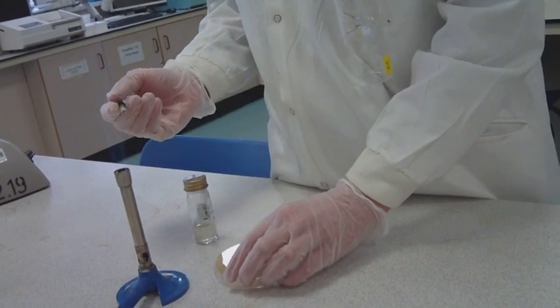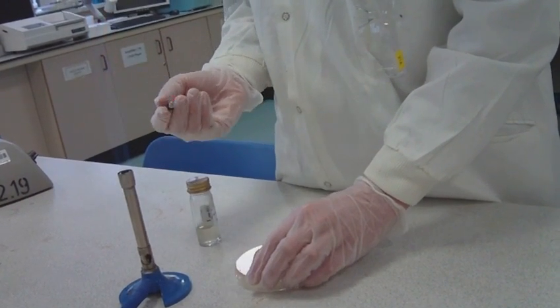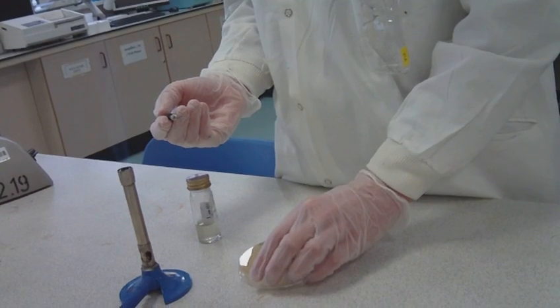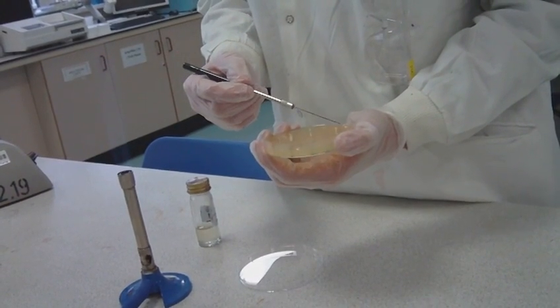Flame the loop and cool it for five seconds. You can touch an unused part of the agar surface close to the edge of the plate to ensure the loop has cooled.